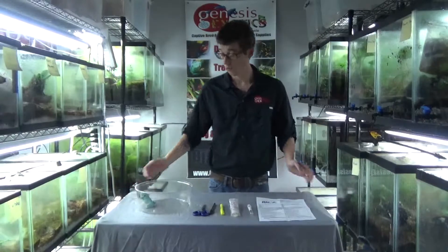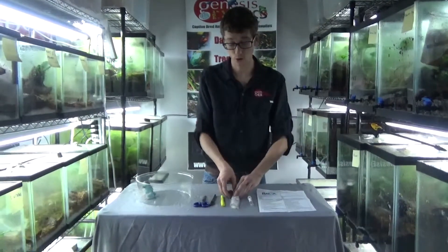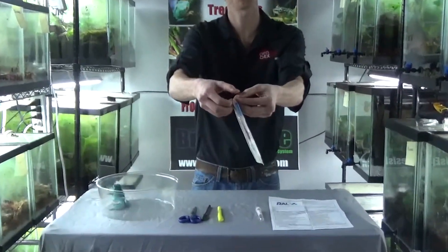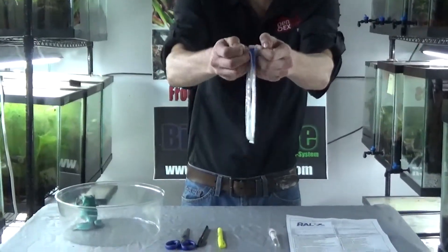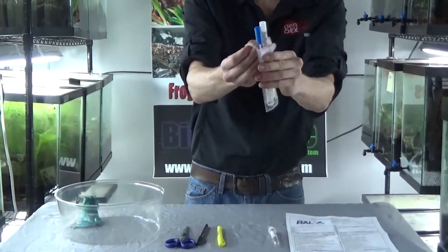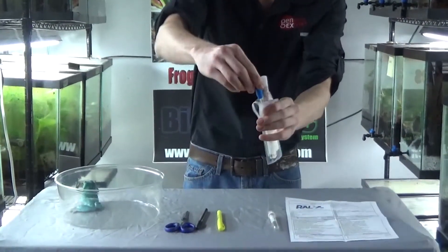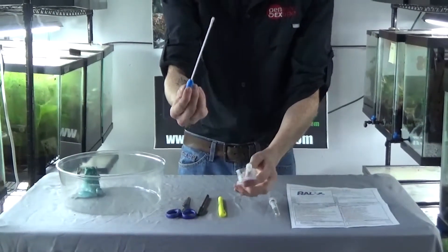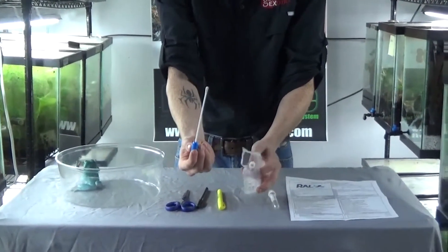Starting with our kit, the first step is to take your sterile culturette and open it up. You want to make sure when you open it up, you keep it sterile. So you peel it open like this, grab onto the blue tip, and pull it out. You want to make sure that you don't ruin the sterile field.